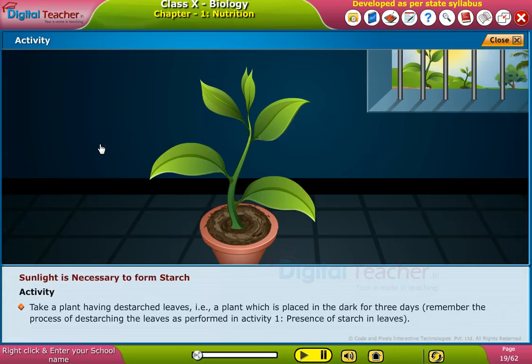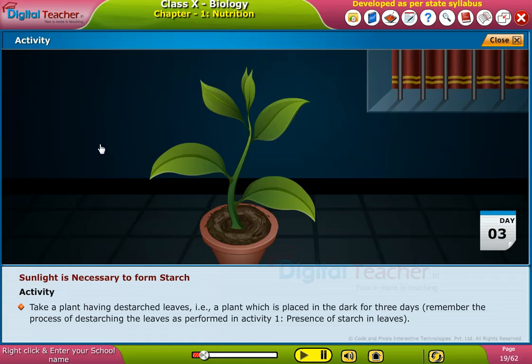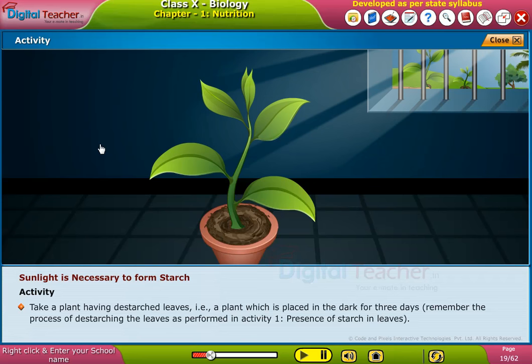Take a plant having these destarched leaves. That is a plant which is placed in the dark for three days. Remember the process of discharging the leaves as performed in activity one for the presence of starch in leaves.